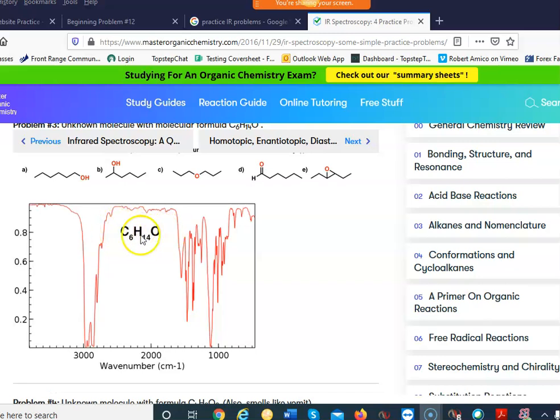Even if I did not even have the formula. Plus, counting the hydrogens, 1, 2, 3, 4, 5, 6, 1, 2, 3, 4, 5, 6, 7, 8, 9, 10, 11, 12, yeah, that only has 12 hydrogens. But even if you didn't do that, you don't have a carbonyl peak, so it can't be D. It can't be B or A because I don't have that OH peak. So the only other possibility is is it C or is it E? 2, 4, 6, 8, 10, 12, 14, where this has 12. Yeah, so it has to be C.